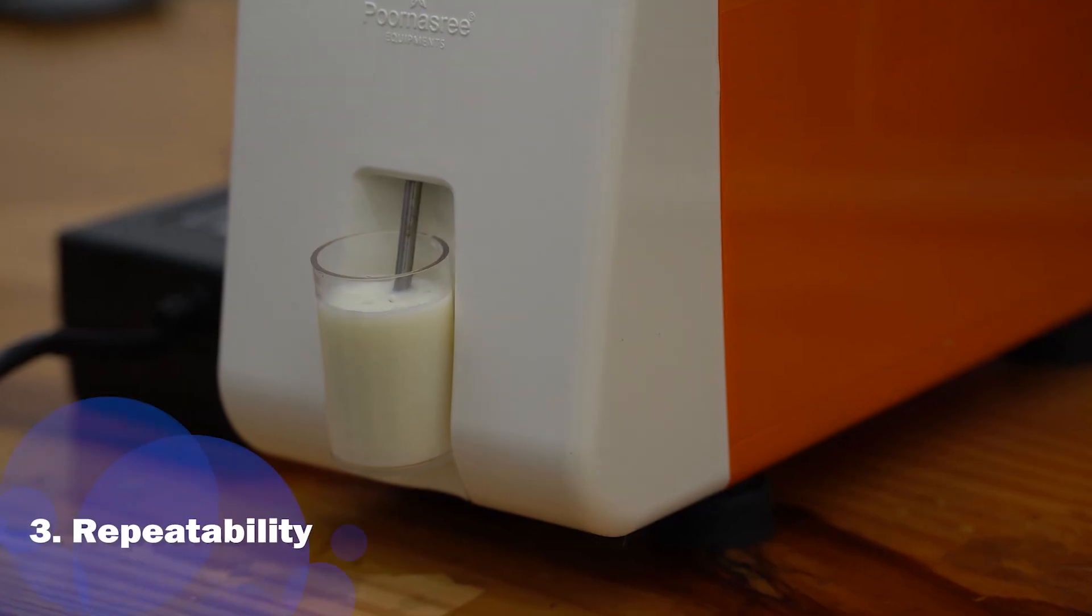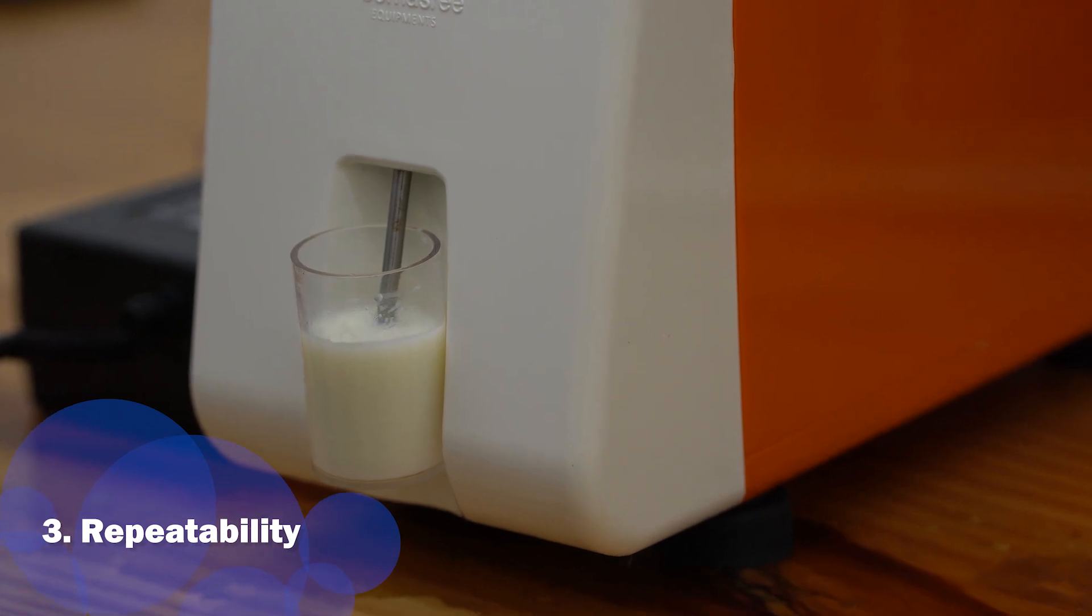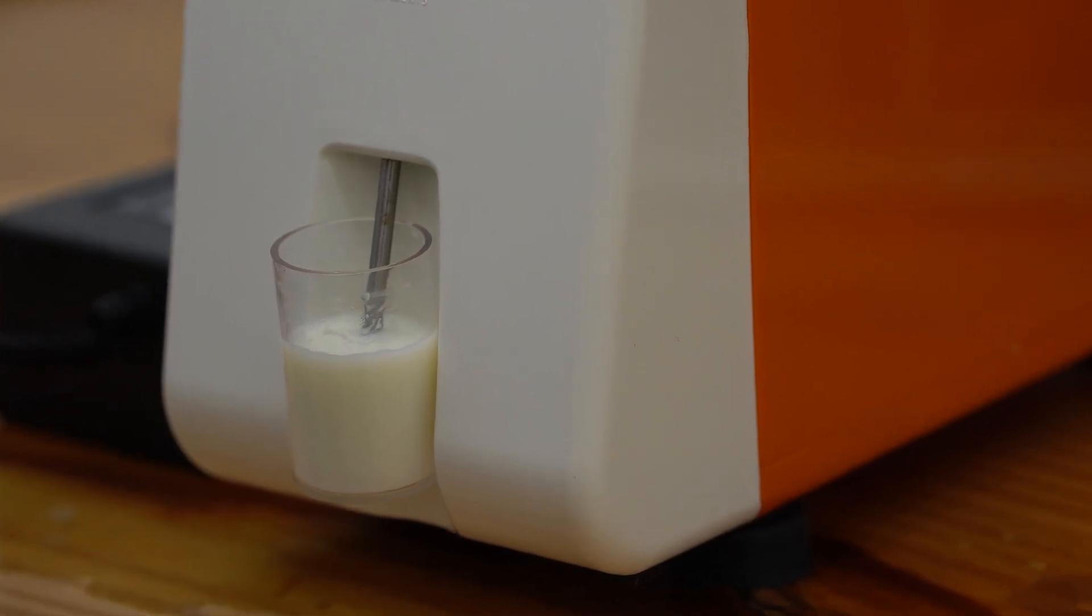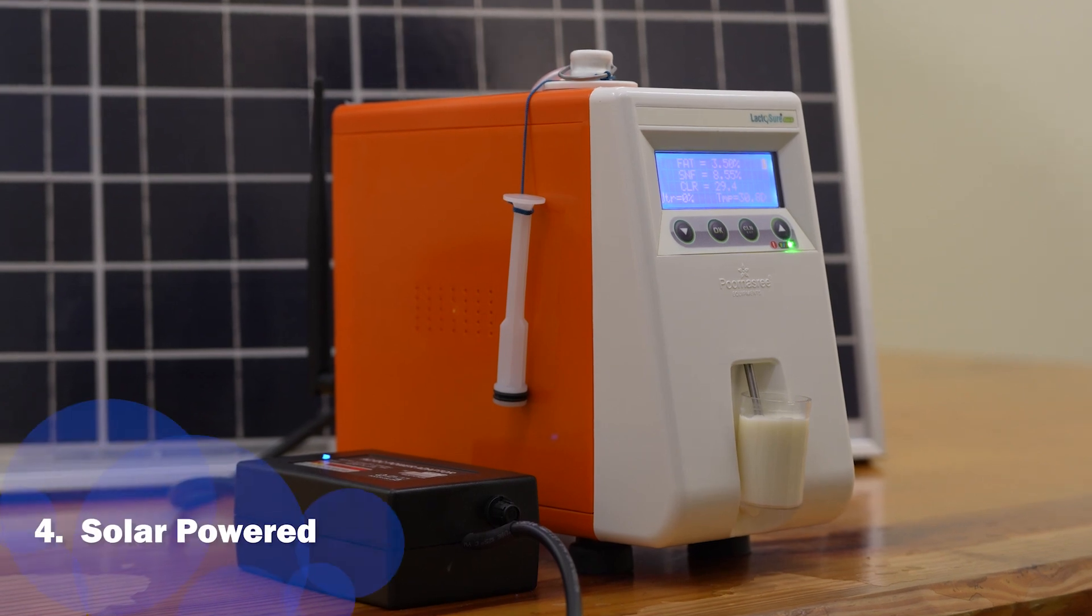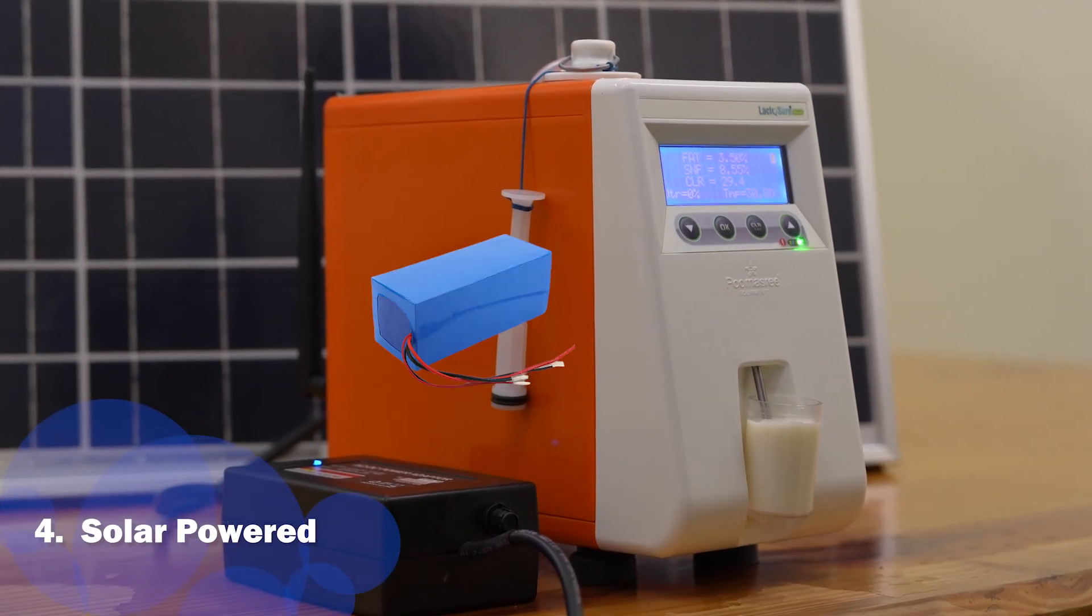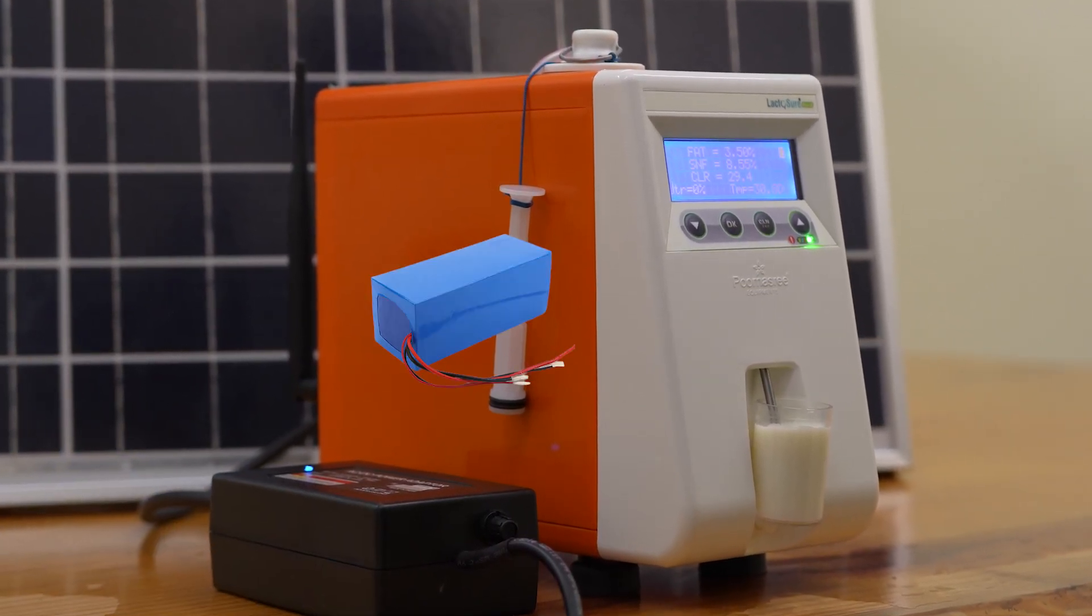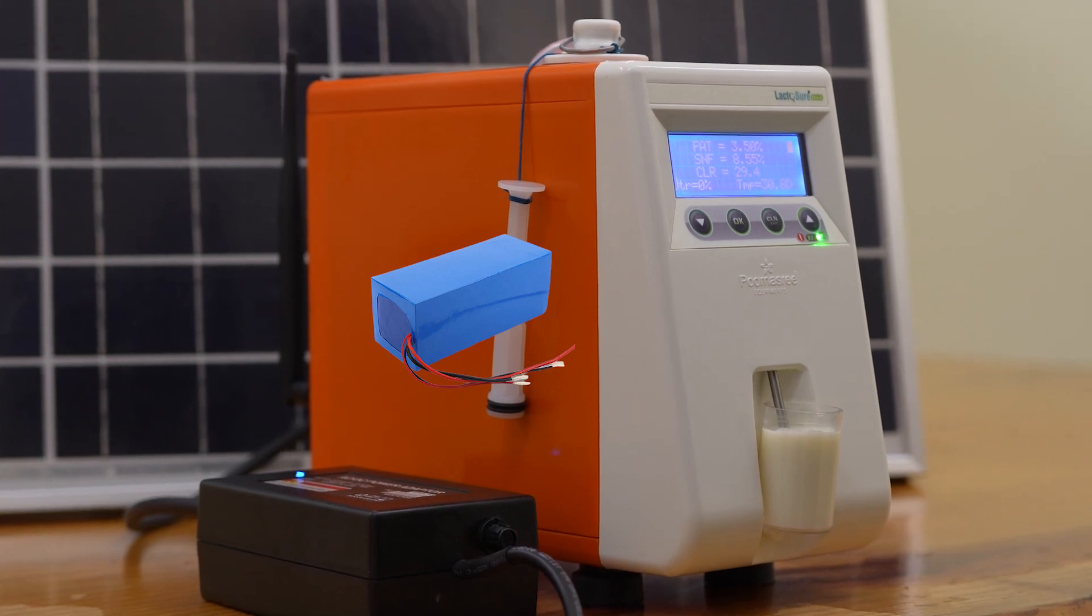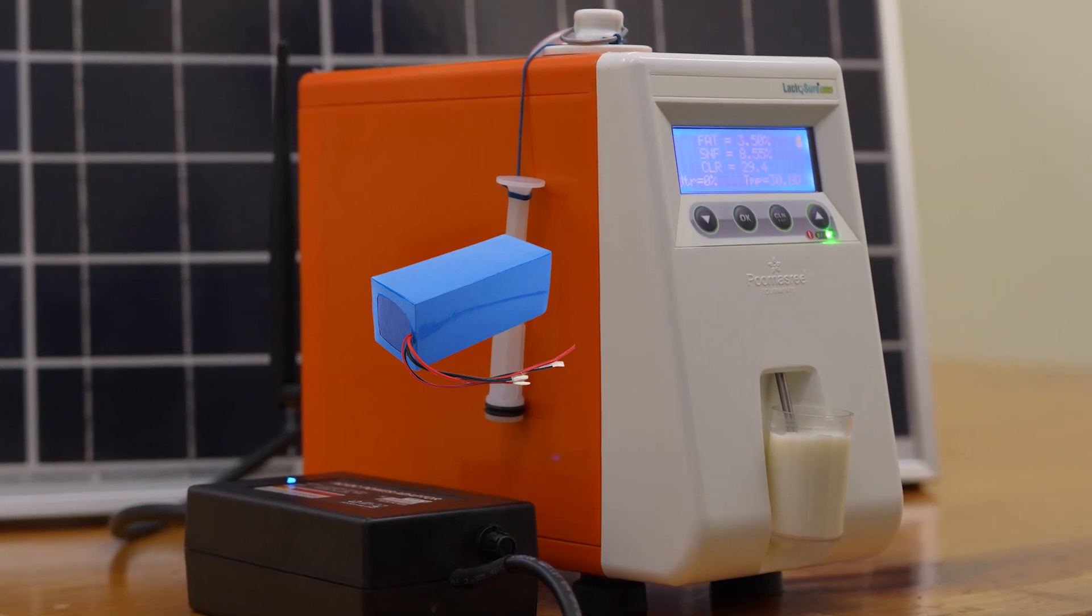Lactoshore equipment has the highest repeatability among all the solar analyzers at present in India. The biggest strength of the machine is the inbuilt battery which is 6Ah lithium ferrophosphate battery with a backup of 3 hours for 1000 testing.